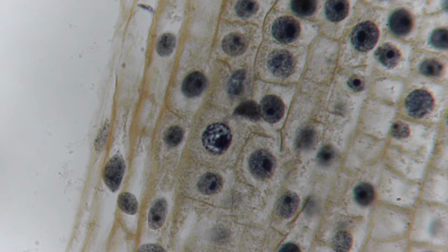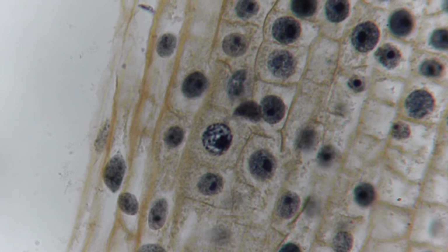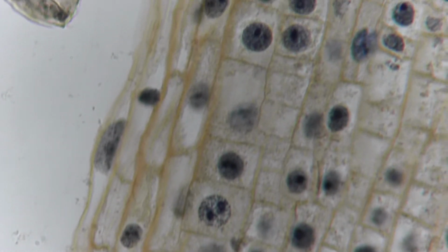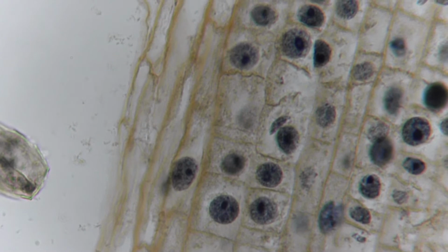They're visible. If you look at the interphases all around, you don't see the distinct little chains. So that's prophase, and the chromosomes look like a pile of worms. Now that's a better one. I'm going to move up and find another one. It's not as picture perfect as that one, but hang on while I slide back up and find a different one.